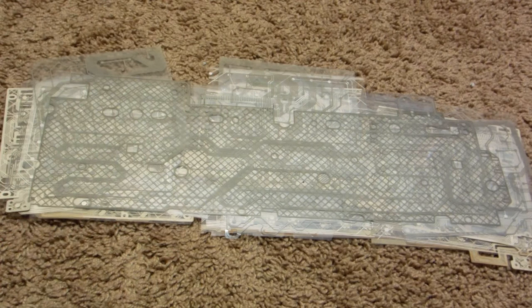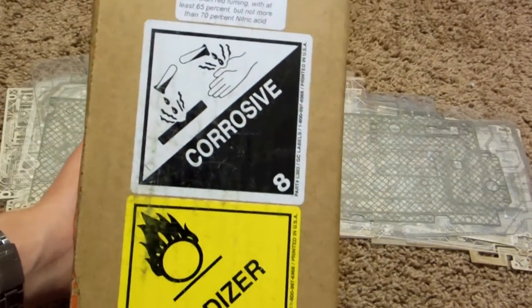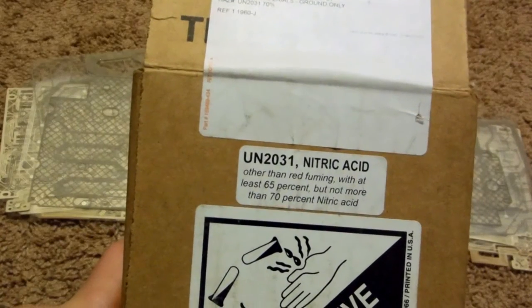And keep in mind that this process will require the use of nitric acid, which today some nitric acid came in the mail. Now, I haven't opened it up yet because I don't really want to deal with it until I get to the lab, which is at my college. But I'm going to have to pay some extra money for hazardous materials charges.